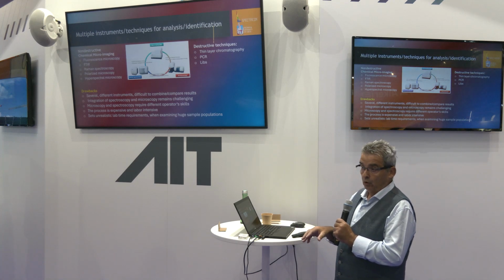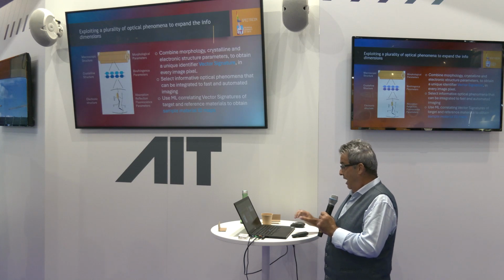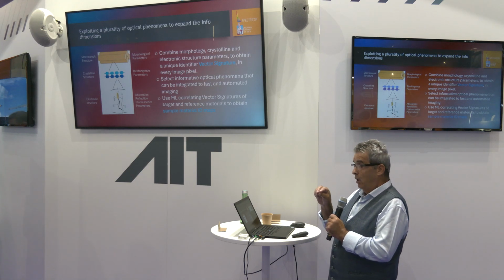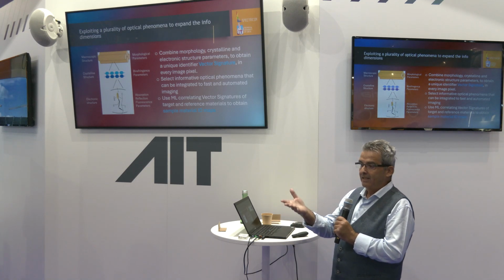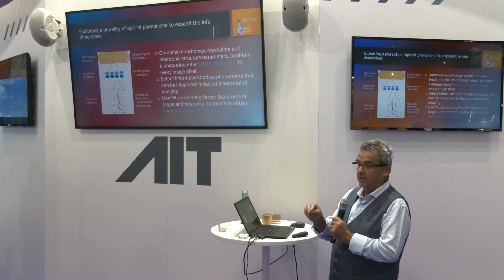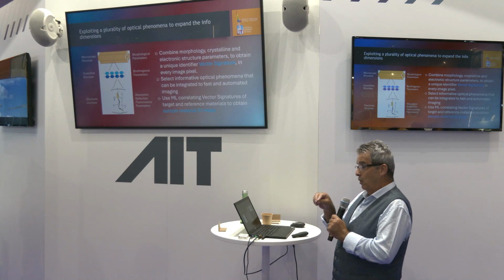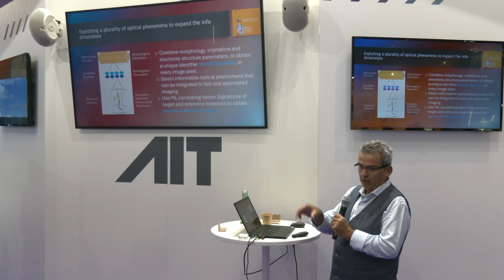That is the problem that we want to address with the multisensorial high-content screening microscope that we have developed. We want to identify even traces or features that are transparent. There are many of those, like collagen, for example. Collagen is transparent, it's scattered, or some other traces in forensics are transparent. In this particular case, we emphasize measuring and mapping anisotropy properties of the material, and particularly birefringence. Second, we want to identify the spectral characteristics of the materials which are related with electronic structure and other structures of the specimen.